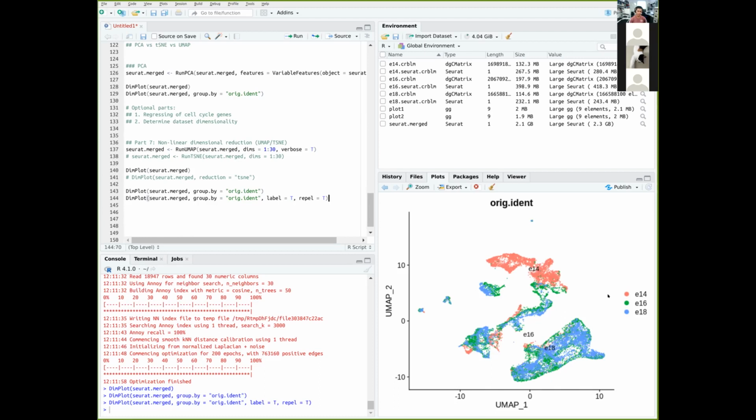So this is roughly how it looks like on this plot. This is where centrally E14 is, E16 is centrally here, E18 is centrally here. Again, I say centrally because this is a central position based on all the cells that you have. And they are so sparse, this is the best position to label these cells.